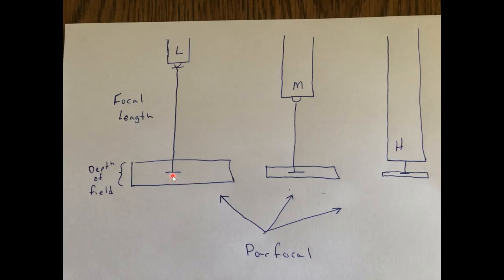It would get crisper and crisper, and if you keep turning it, which you will, it's okay, it gets less and less, and all you do is just stop and go back until it's nice and crisp. Well, the depth of field is wide enough with a low power lens that it makes it quite easy to use.